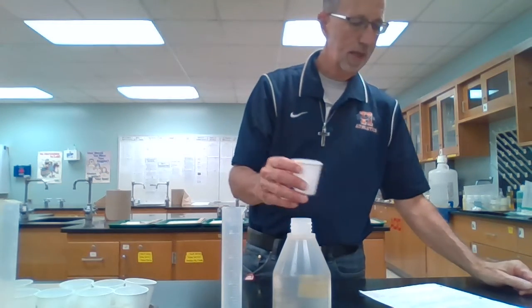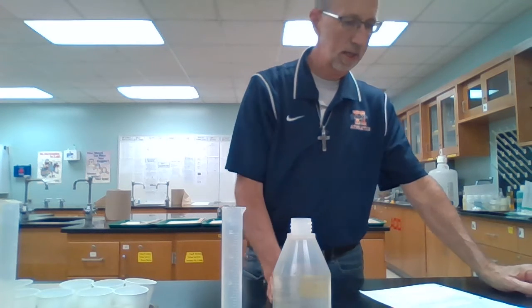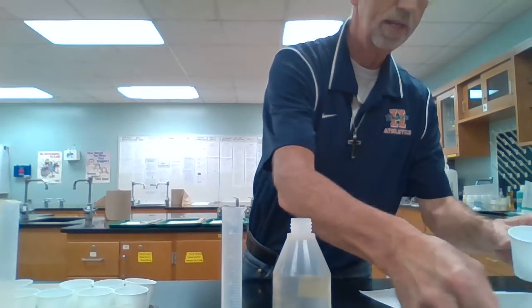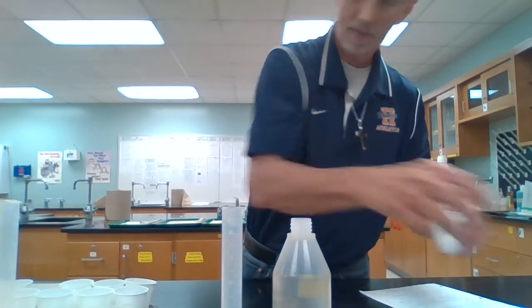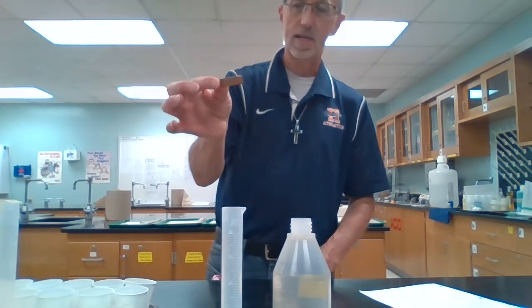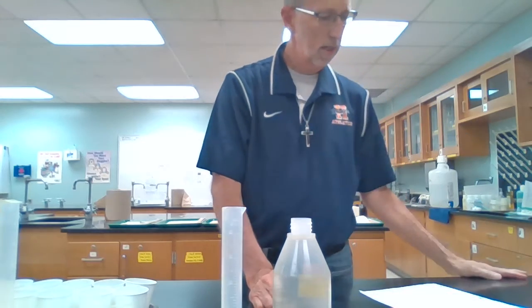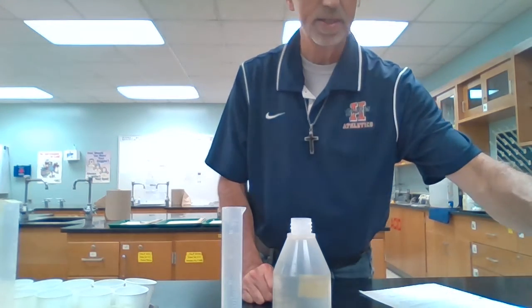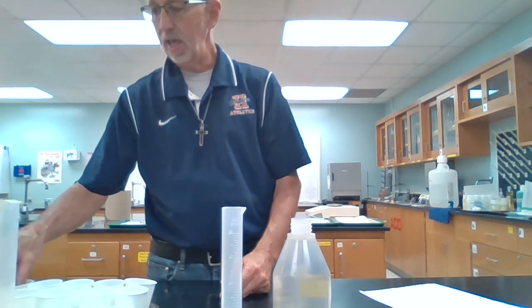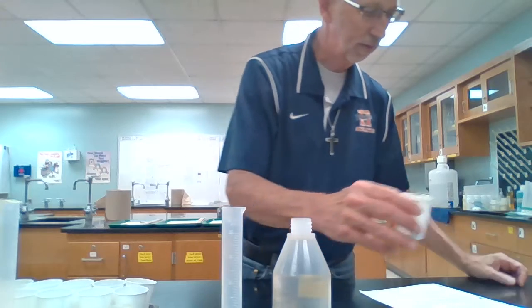Number 4, again, we got pieces here, and that is 9.83 grams, 9.83. Put that back. And number 5, got a rectangular solid here. Number 5 is 63.05 grams, 63.05. And the last sample of copper, number 6, we've got a lot of pieces in that one.